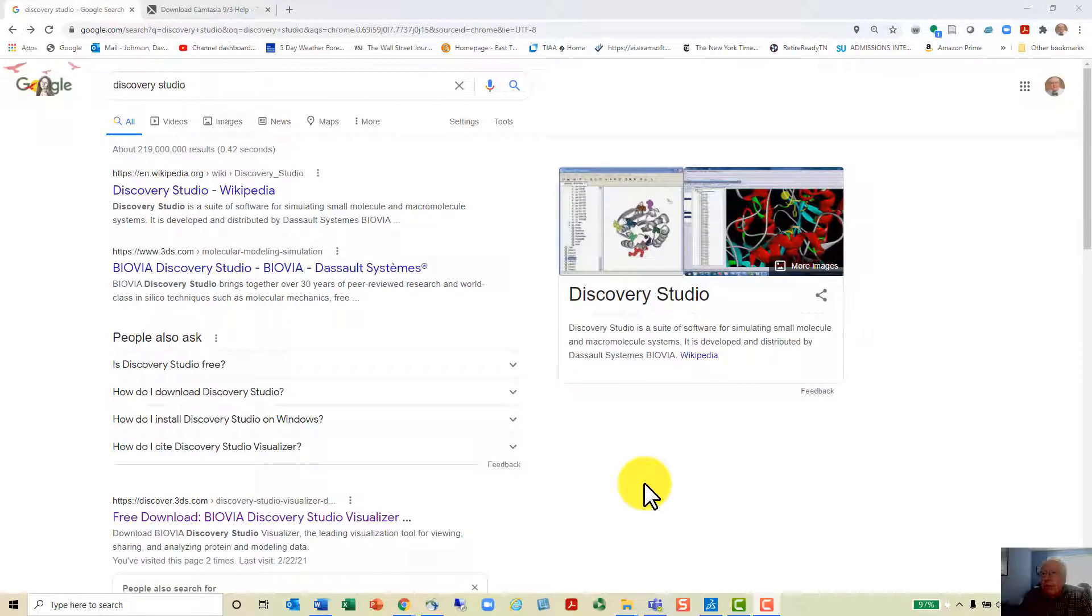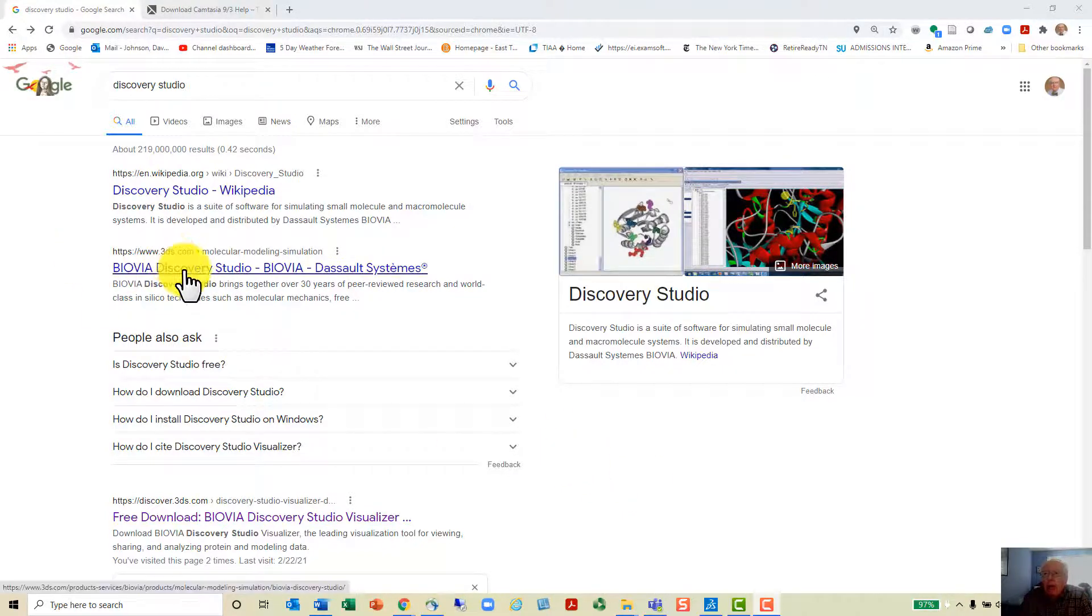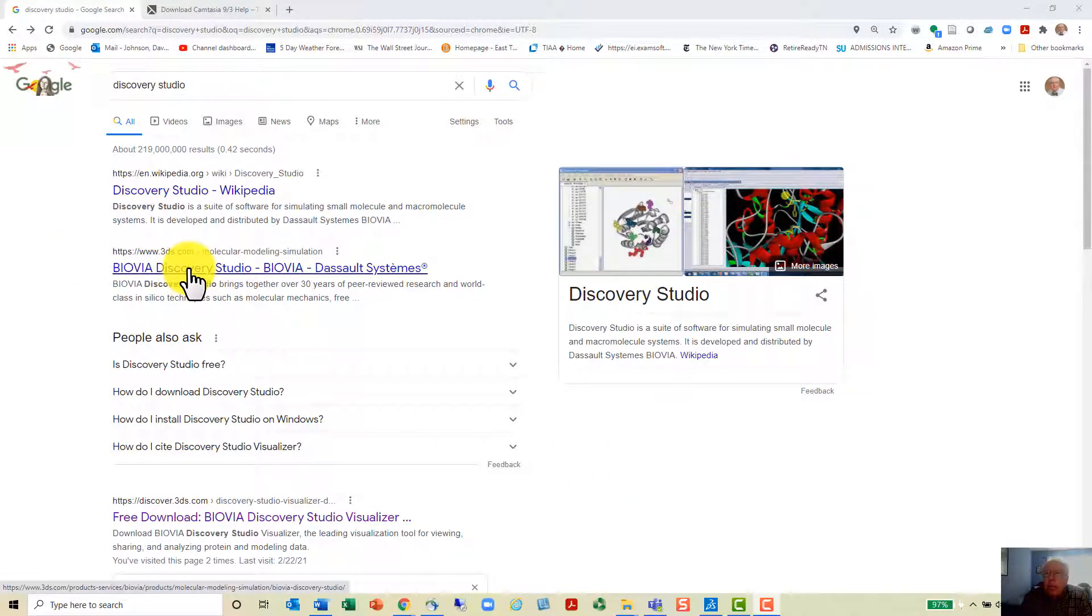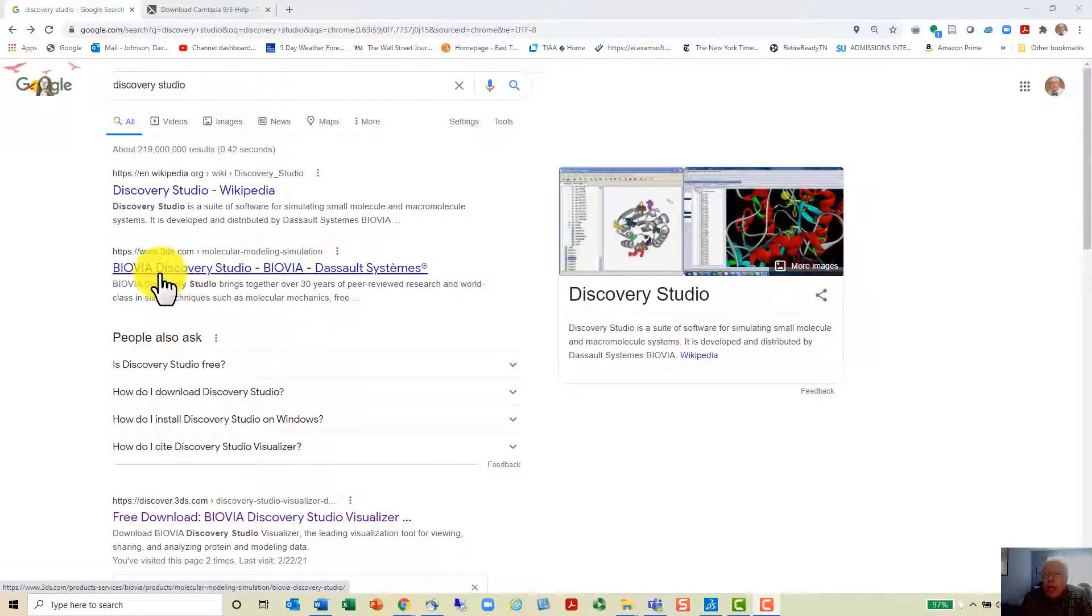This is Dr. David Johnson with a brief introduction to Discovery Studio, which is a molecular observation, viewing, and modifying protocol that helps you work with molecules of various types. It's a very nice piece of software.